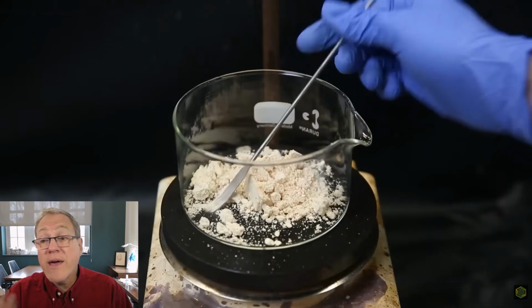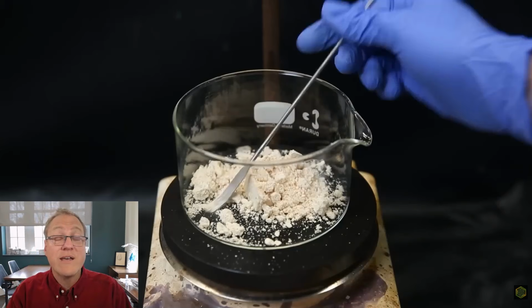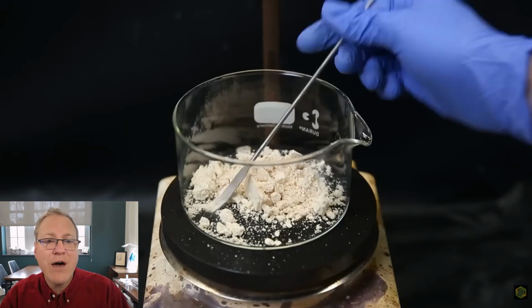Now, what I think would be interesting is how pure is this? Did he see any dinitration product? There's a way you could figure that out fairly simply. If you took a TLC of that mixture, you might see multiple spots in there. You might not just see the product spot, but other spots that arose from different nitration products. Maybe he got a small amount of hydrolyzed amide in there, so he has a free amine, so he'd see that. So there's a way to kind of take a peek and see how good that is.